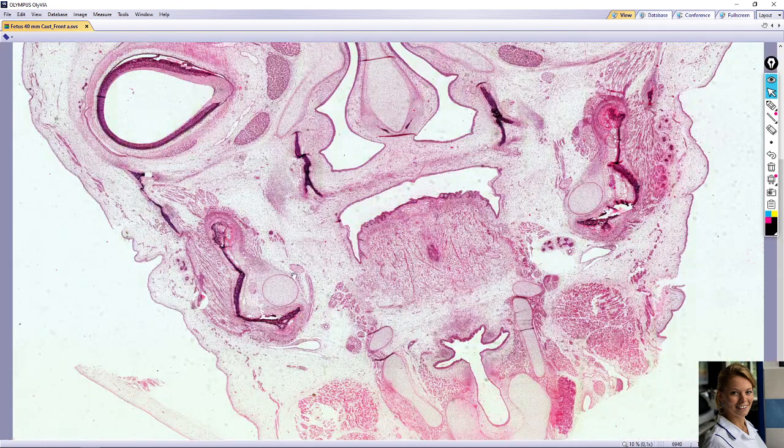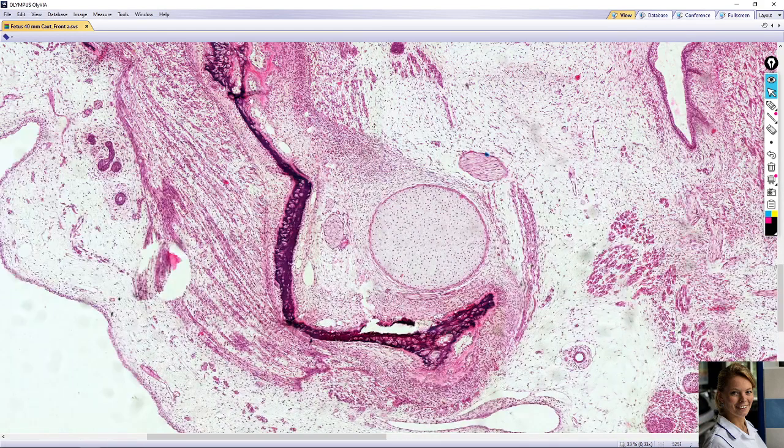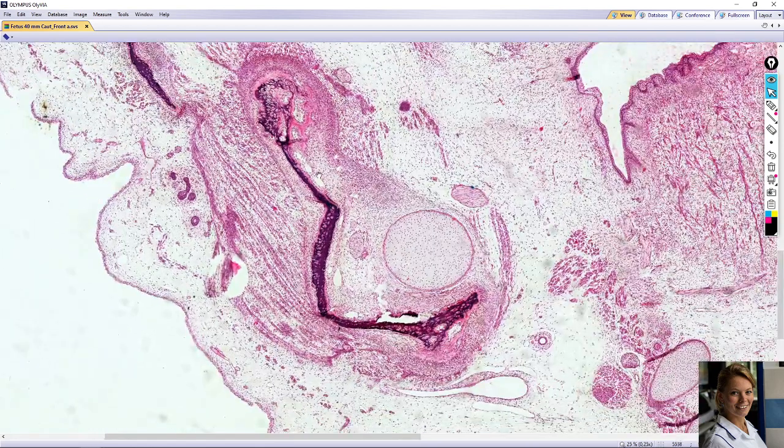Here is Meckel's cartilage, one, and a second Meckel's cartilage, which is near the mandible. Here it's forming the mandible. The mandible is formed via desmogenous or intramembranous ossification, and we will focus on this part of this slide.